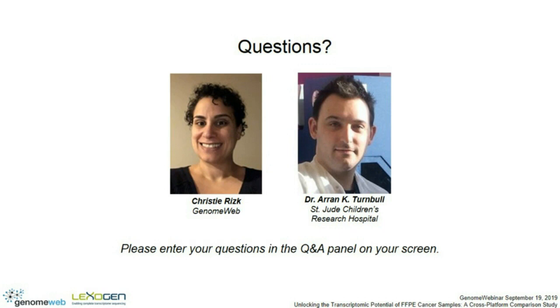We are quite lucky here in that we have support staff that do collect fresh frozen tissue for us. But the logistics and challenges involved in that include things like taking liquid nitrogen into theaters in order to collect the tissue and preserve that immediately, because obviously RNAs begin to degrade very, very quickly. And so it is a logistical challenge. We have never really looked at anything else other than comparing high-quality fresh frozen tissue, in which we took liquid nitrogen into theater or the clinical room and collected the biopsies directly as our gold standard, and then FFPE on the other side. We've never looked at anything else.